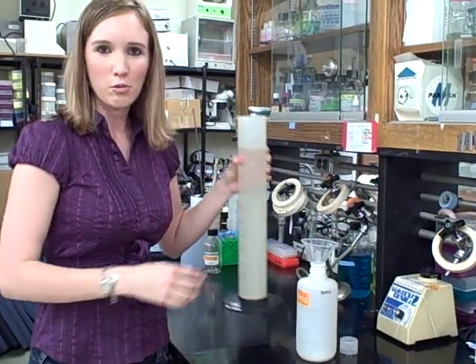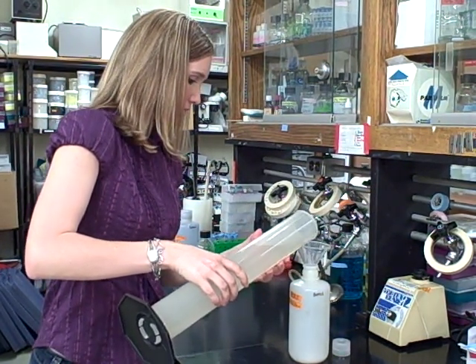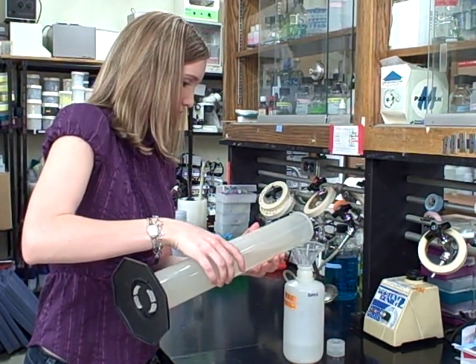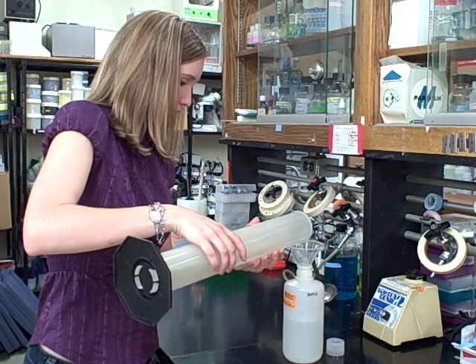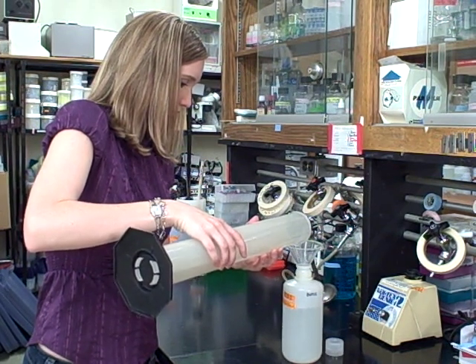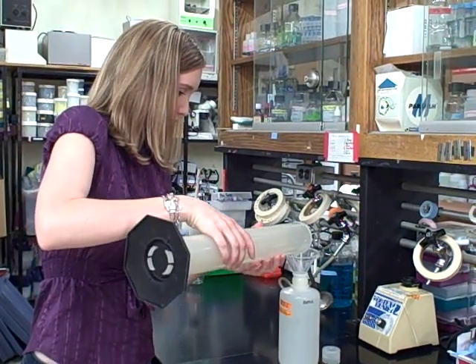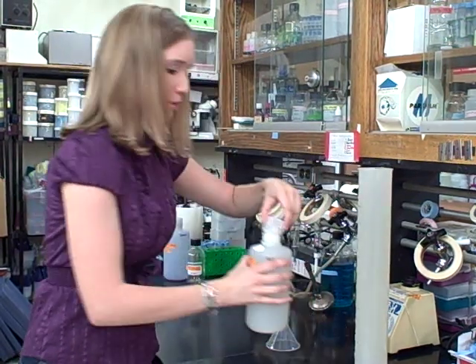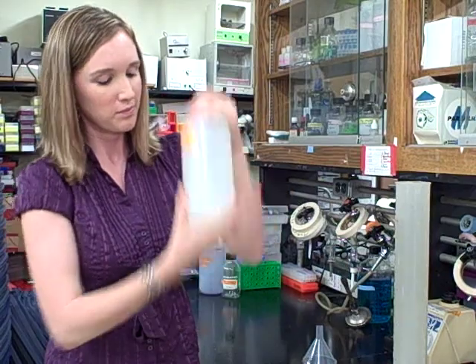Then I'm going to add about 1 liter of deionized water to that. I'm going to cap the bottle and shake it up really well. Now your TBE buffer is ready to use.